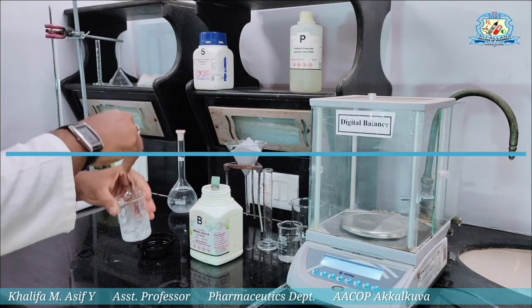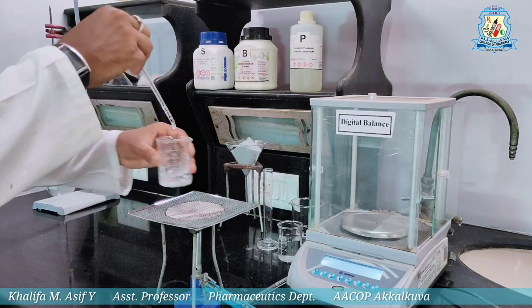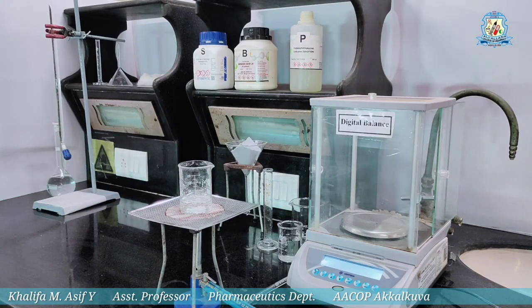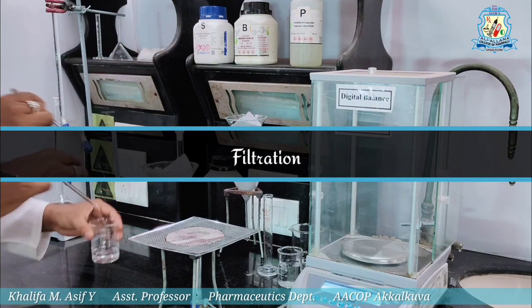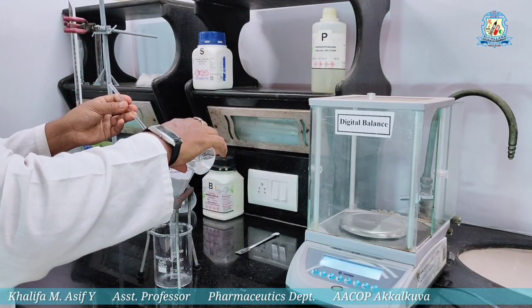You can see some undissolved solid is clearly visible. For complete solubilization of this solution, I have to go for heating. By increasing the temperature, we can increase the solubility of the solid. As you can see, all the solute has been dissolved completely. And now we will go for the next step, that is filtration.